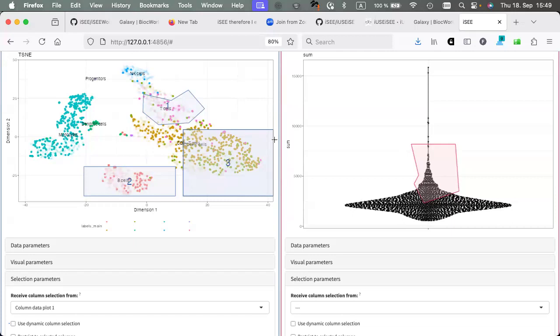There's not just one way to do that. One could just simply have these objects dangling around in your sessions. Or maybe you can actually think, okay, I'm going to use the metadata slot. I'm going to thicken that up, plug in all the bigwig files and the things that need it, so I can tell where this information might be. And then you develop a panel that feeds on that information.